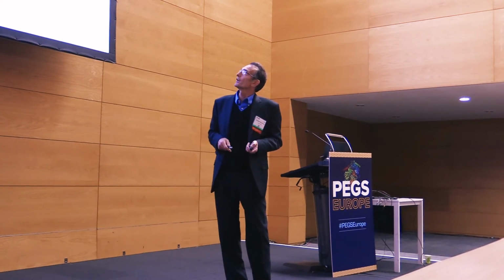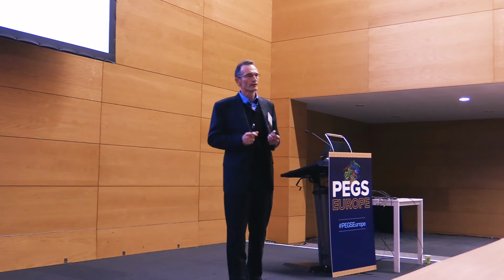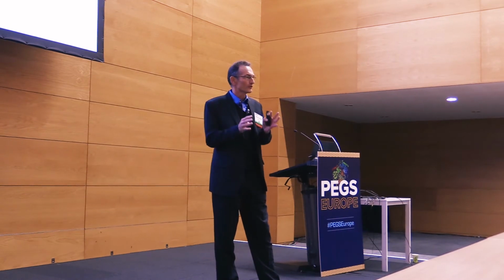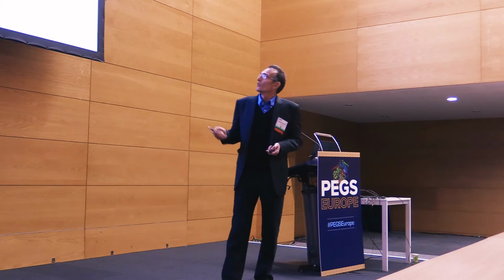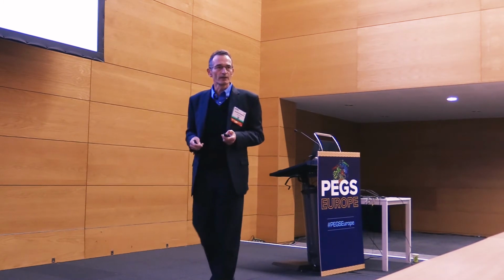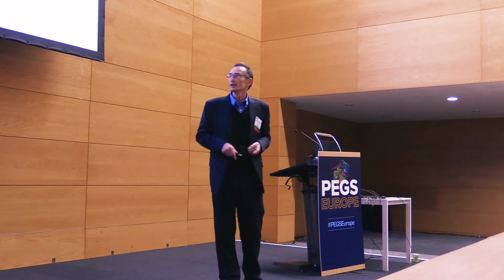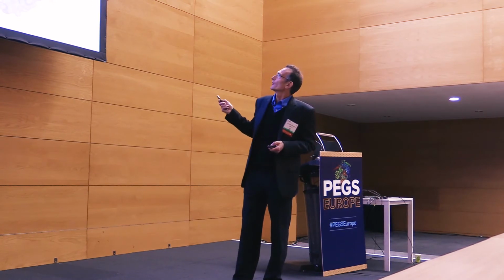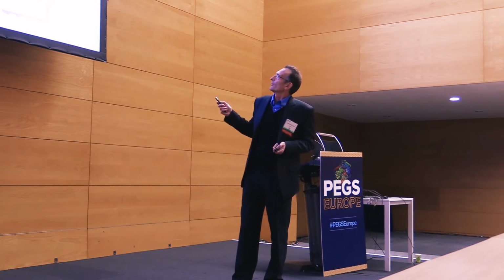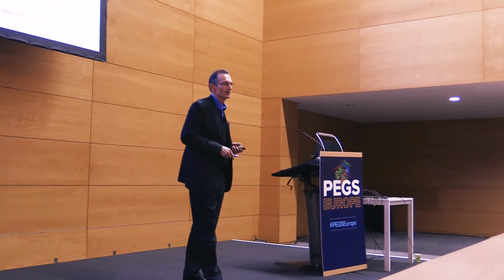So our general library design strategy was to first choose the best scaffolds, and we reasoned that the best scaffolds are those that are in the clinic, the best therapeutic scaffolds. There are many different therapeutic antibodies out there. We then isolate natural CDRs, either by next-gen sequencing or alternatively by PCR in the case of the heavy chain CDR3. We now eliminate from those CDRs those which have sequence-based liabilities. And now we embed those CDRs within our good scaffolds, producing essentially a library which has the same scaffold, but with multiple different CDRs that have been pre-screened to not contain liabilities.